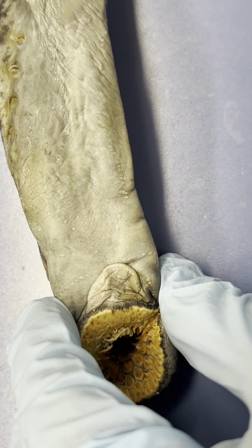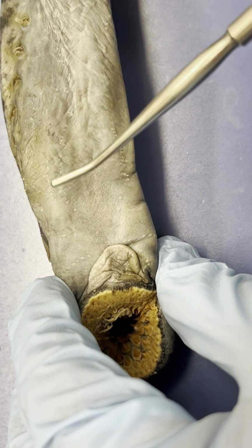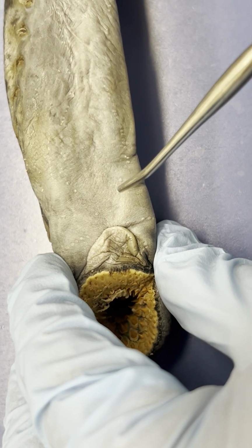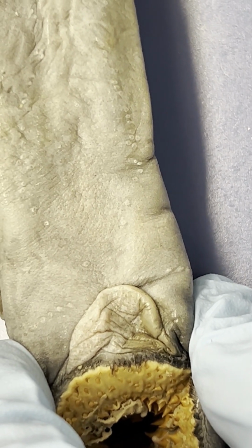I want you guys to think of, what do you think the function of these bumps are for a fish? And then look it up to figure out if you're right or wrong. So make a hypothesis. Why do you think this lateral line system is intact with this lamprey, okay?